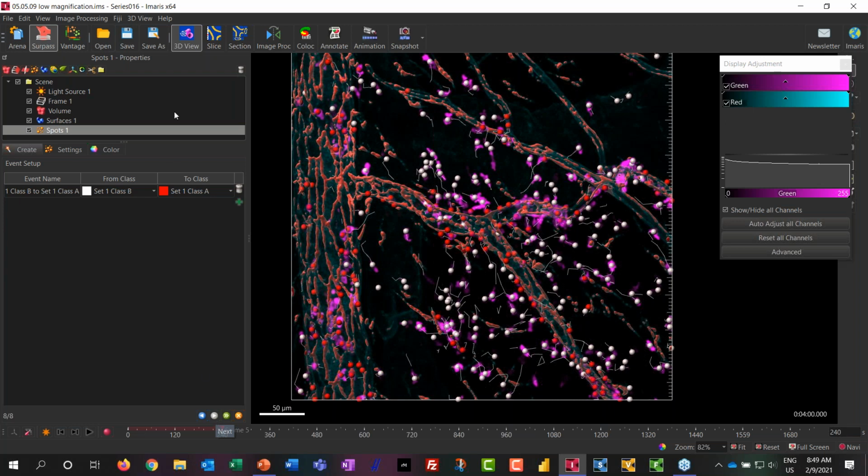The way it will start off being presented to you is like this: class change, any to any. So from any class to any class, it will create an event whenever any class change occurs. I want to be more specific than that, and I think most of the time you will want to be more specific too. This is just a really nice default setup in the beginning. So when you click on any, it will say from what class. I want to say from far away.